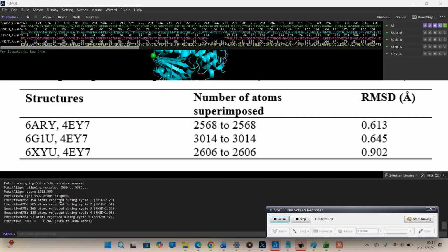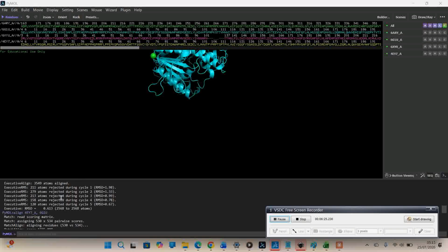So once that's done, we now want to confirm specifically the matching amino acids. To check the matching amino acids, since we already started using the 4EY7 human enzyme as our reference structure, we will first identify the amino acids of interest.